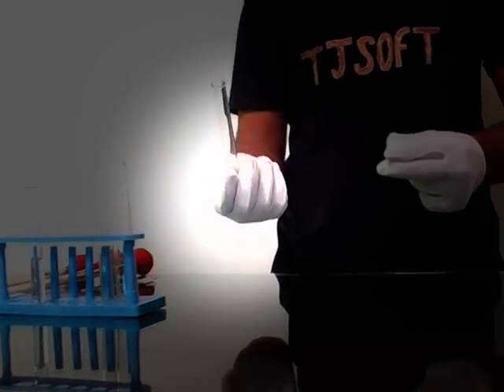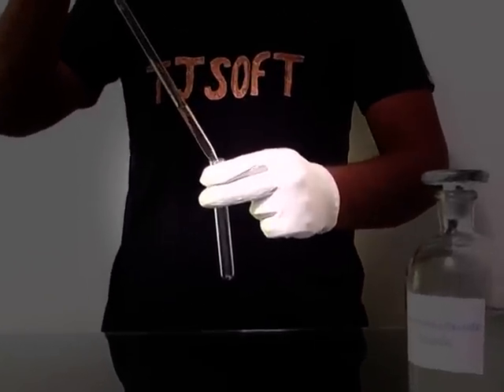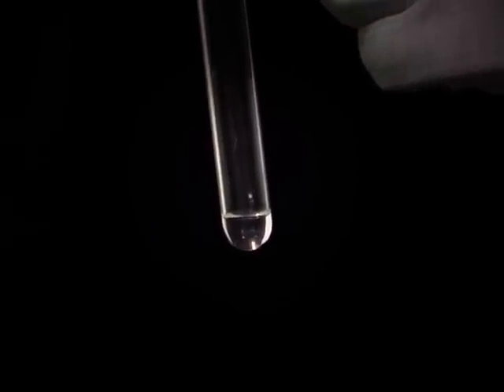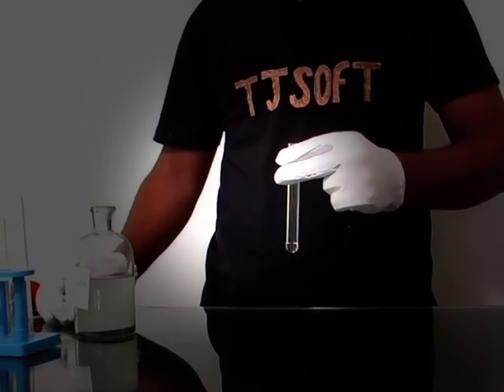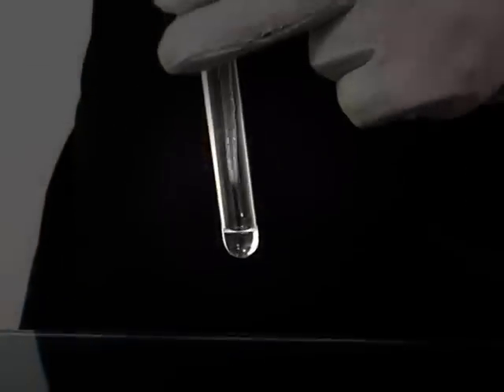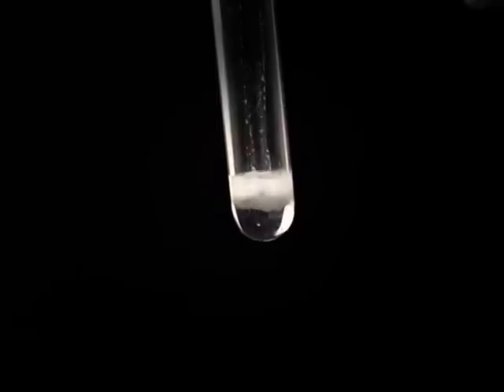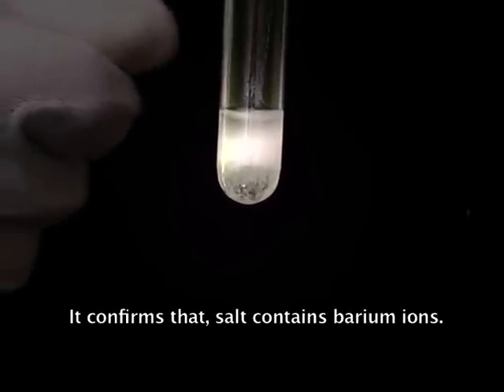We have another experiment to confirm it again. Now take another test tube and add one ml of original solution into the test tube. With the help of a pipette, add a few ml of ammonium oxalate solution. Observe here — the white precipitate is forming in the test tube. This confirms that the salt contains barium ions.